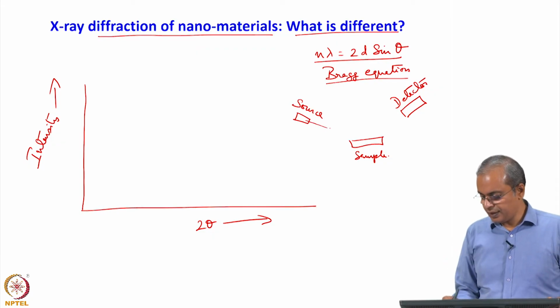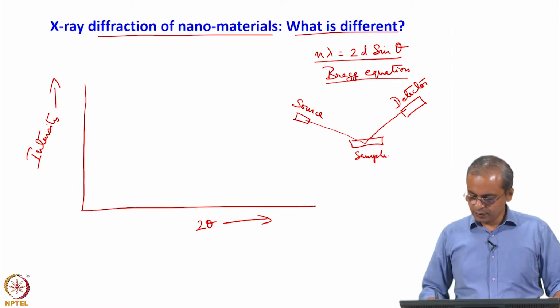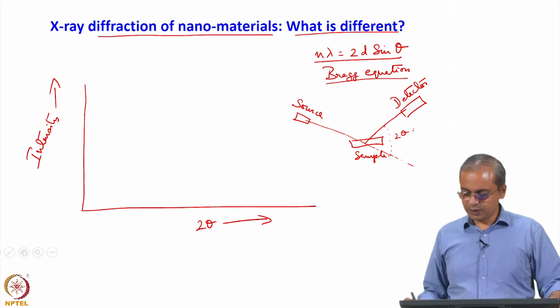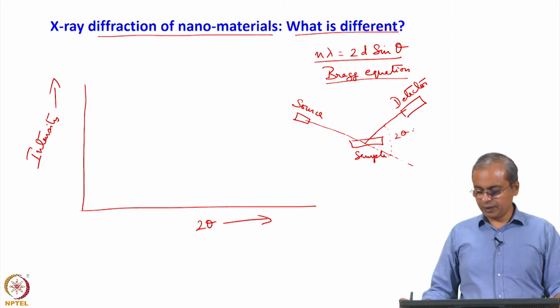So, you have this angle and this is your 2 theta. Okay, so, that is your 2 theta angle that we are looking at.